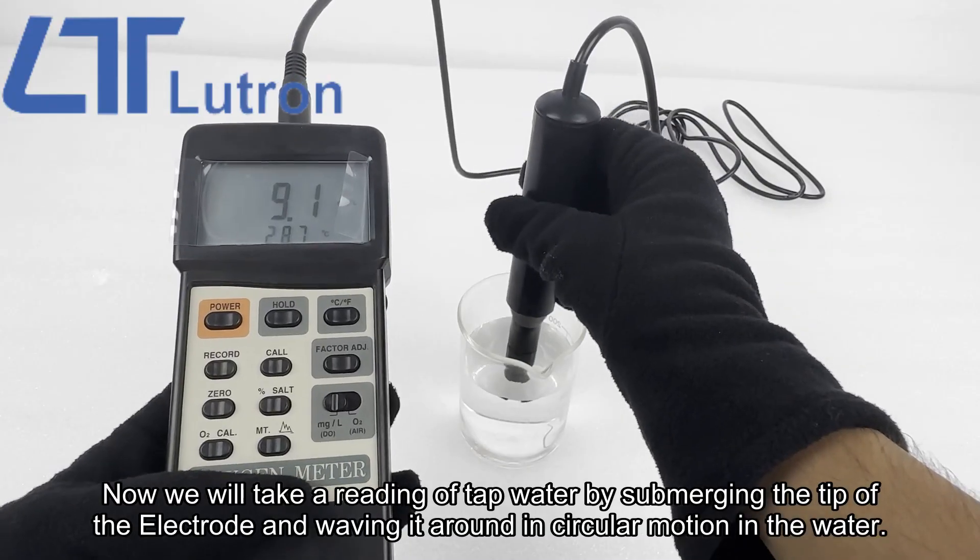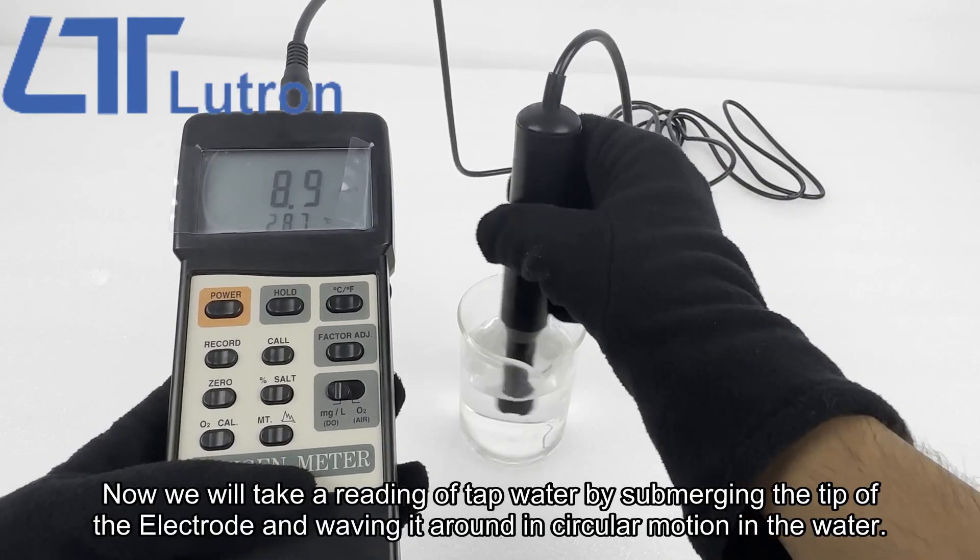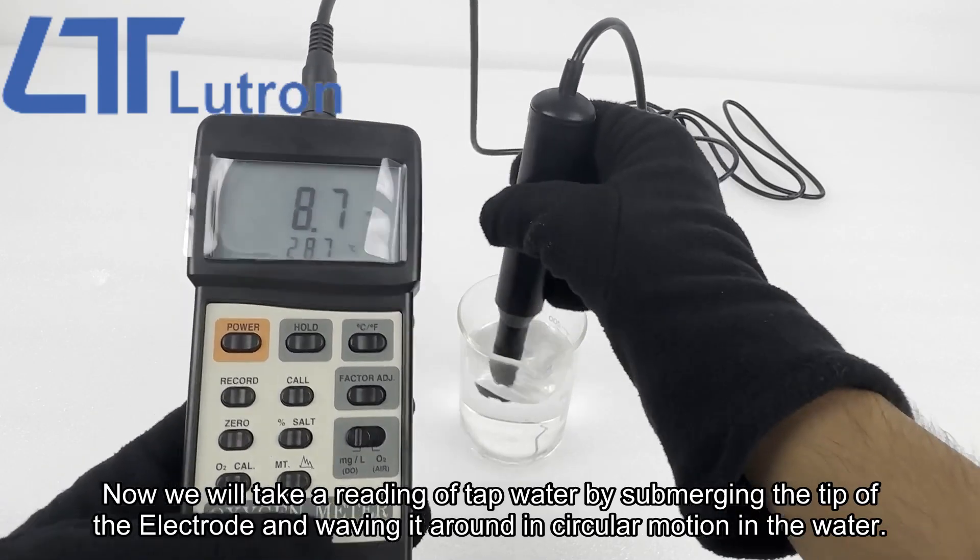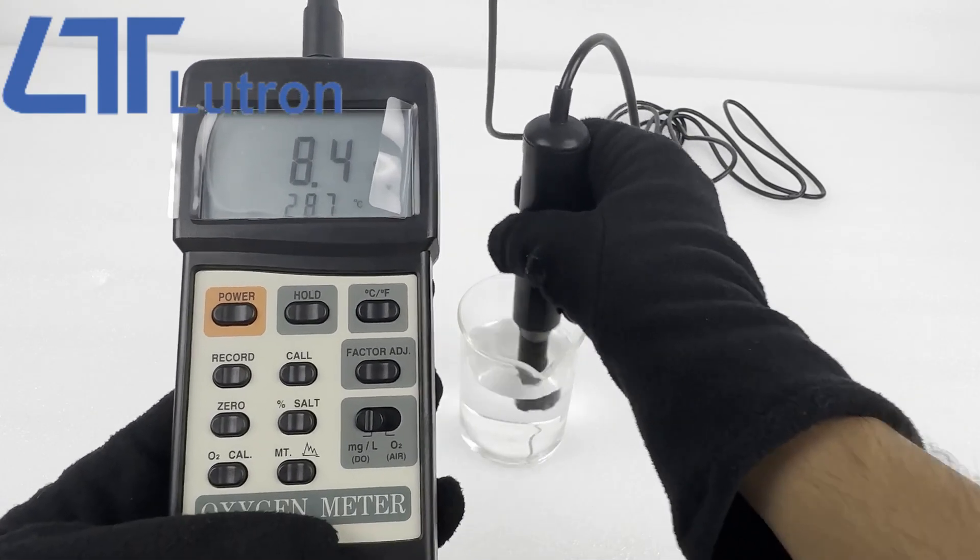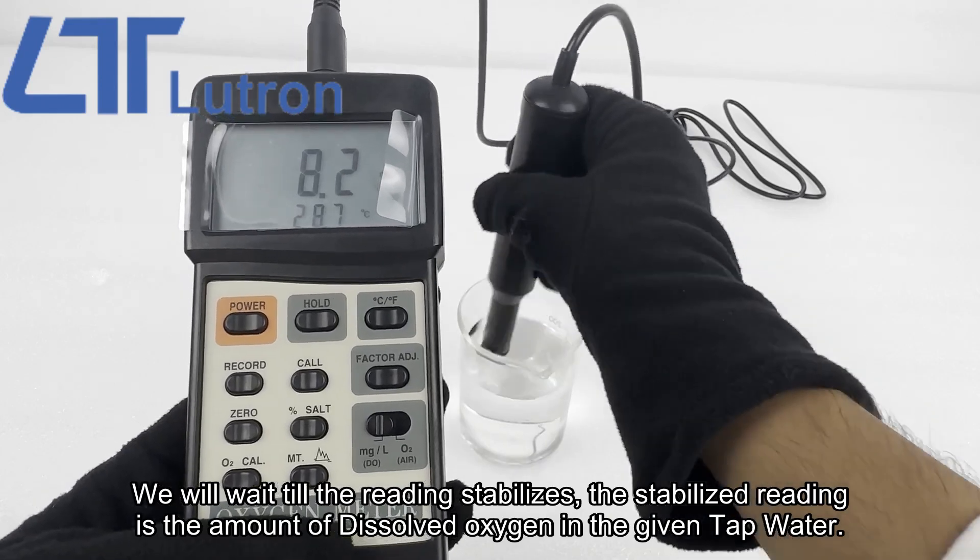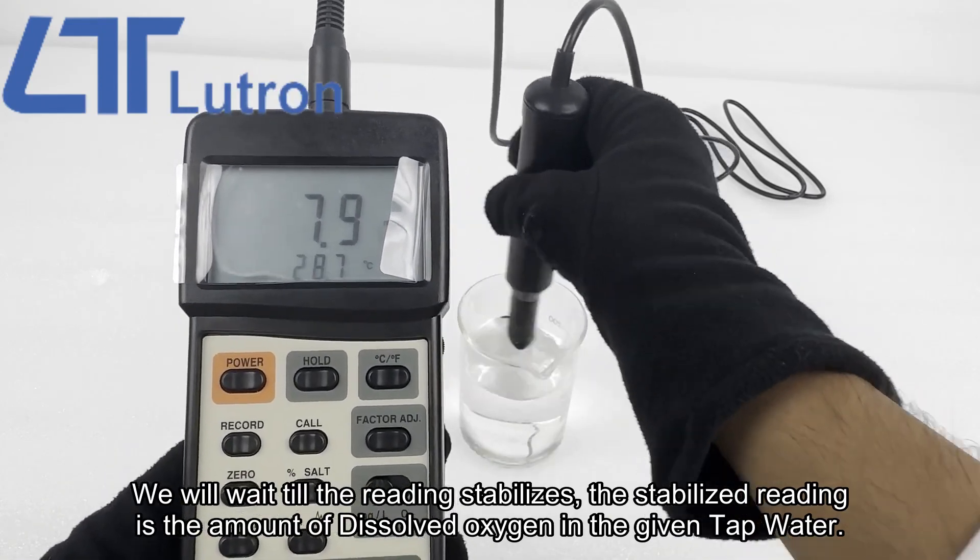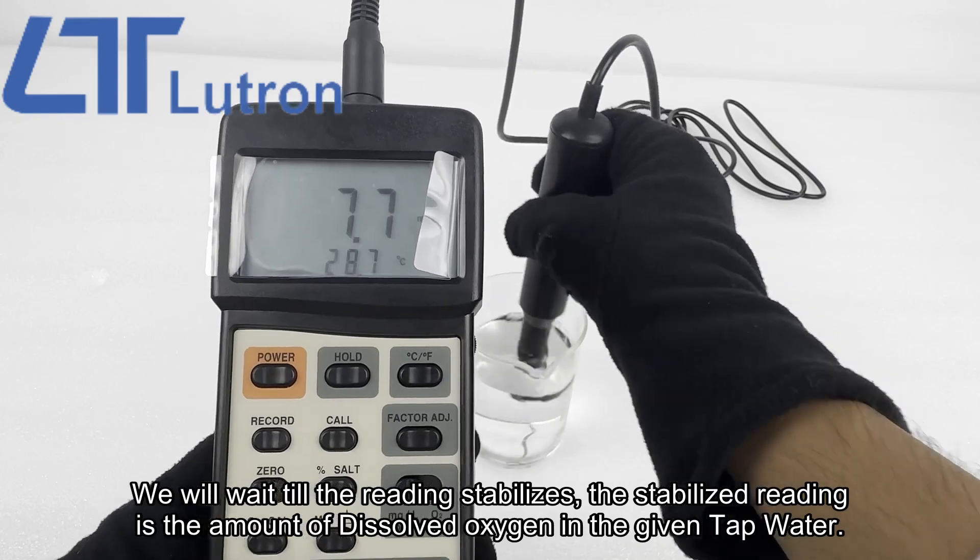Now we will take a reading of tap water by submerging the tip of the electrode and waving it round in circular motion in the water. We will wait till the reading stabilizes. The stabilized reading is the amount of dissolved oxygen in the given tap water.